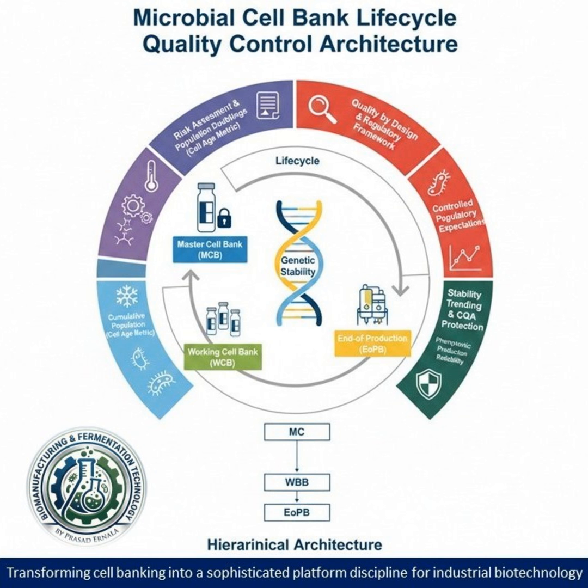The calculation itself, I saw it uses a logarithmic formula. That seems like a huge effort to track across a multi-step process. It is complex. And that just speaks to the rigor that's required. You calculate the population doublings for each step, and then you have to sum them across the entire chain. From the initial clone to the MCB, with MCB to WCB, and finally the WCB through all the stages of the seed train. And this data has to be tracked for every single campaign.